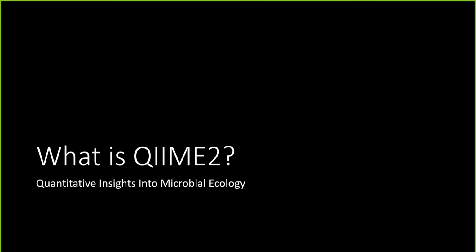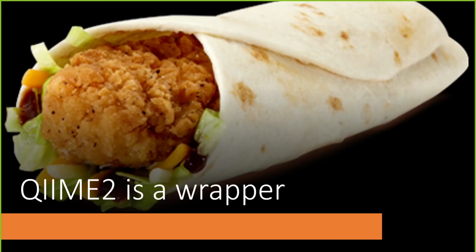And QIIME2, if you Google it, it's actually a wrapper program. So it's kind of like a burrito shell, like a tortilla. It holds everything inside of it that you can then easily run commands through. So it's supposed to make things simpler once you get it installed.